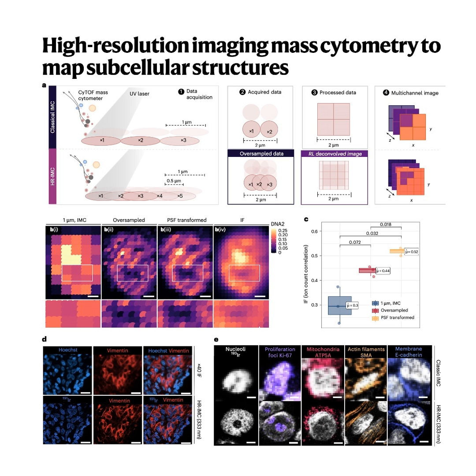Okay, wait, let's slow down on that term. An inverse sigmoidal function sounds incredibly dense. Can you break that down? For sure. Just think of it like trying to remove a stain from a shirt. First time you scrub it, you remove the most material, right? Of course. The 5th time you scrub, you're removing very little because most of it is already gone. Your effort becomes less and less effective. Diminishing returns. Exactly. That sigmoidal function models this nonlinear diminishing return destruction.